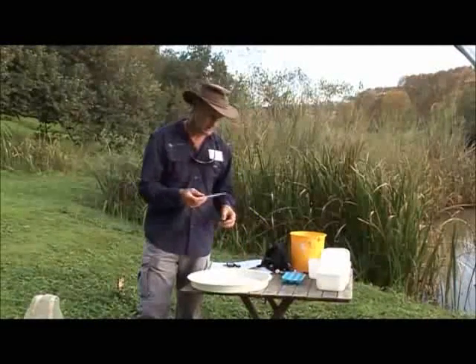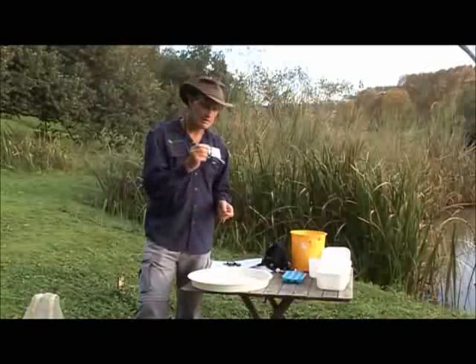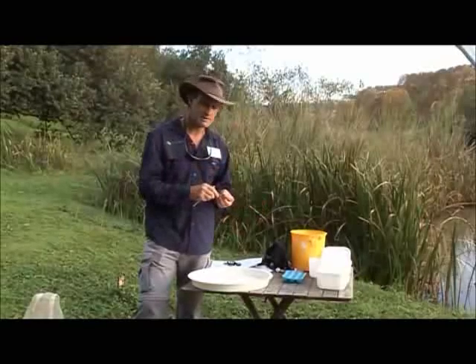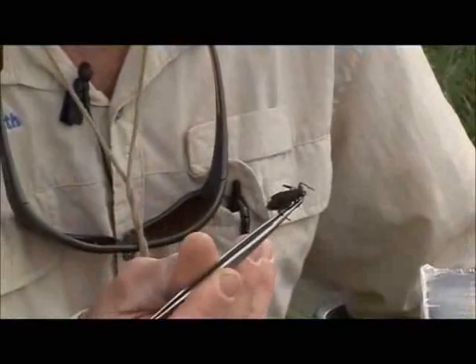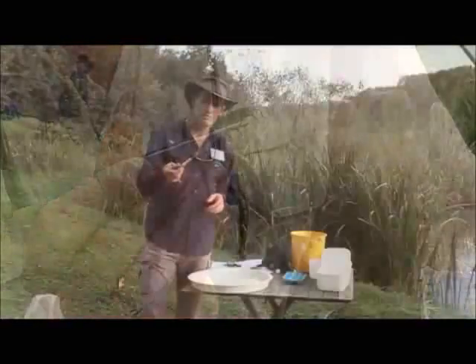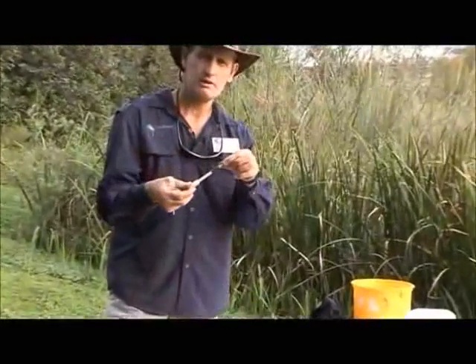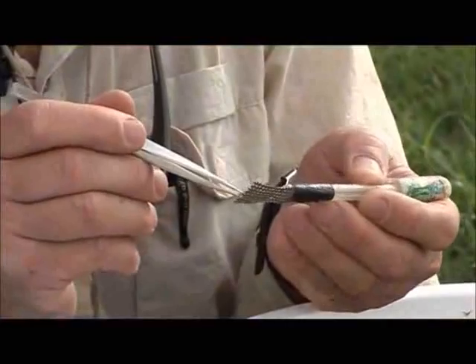You would usefully have a small sucker to allow you to suck up organisms and plunk them into your hand or into a further tray for further examination, a pair of forceps to pick things up, and perhaps, again, personal preference, a small sucker with a little net on the end to help scoop out the organisms that you're looking for.